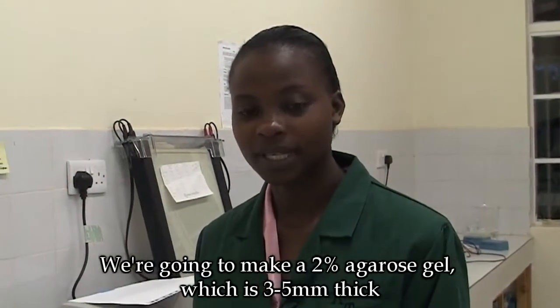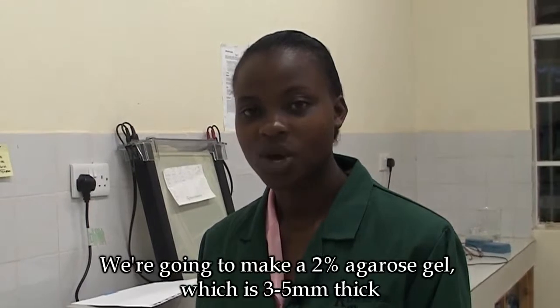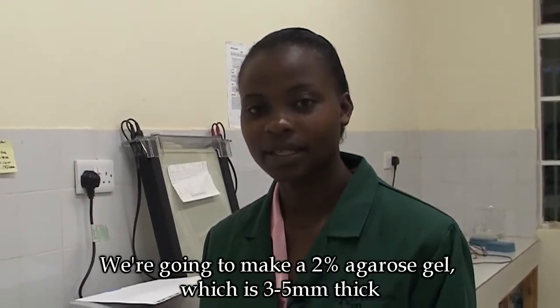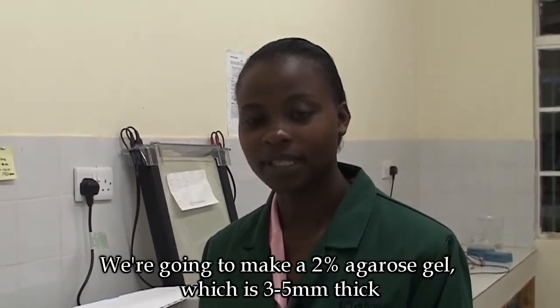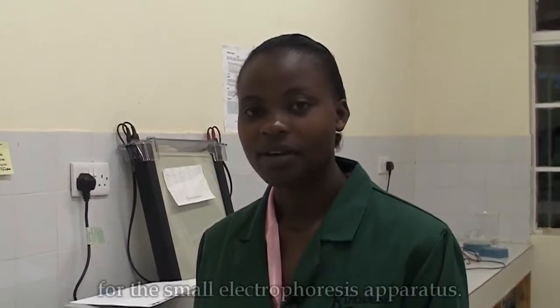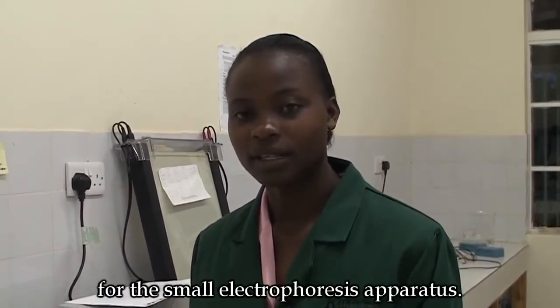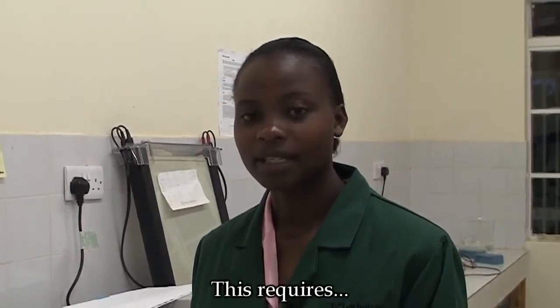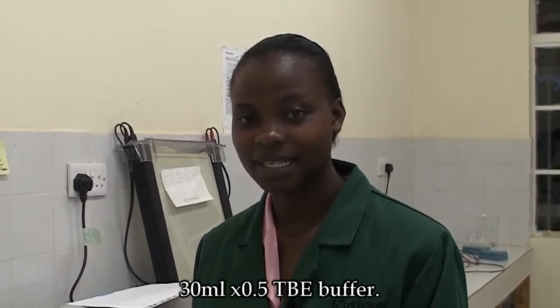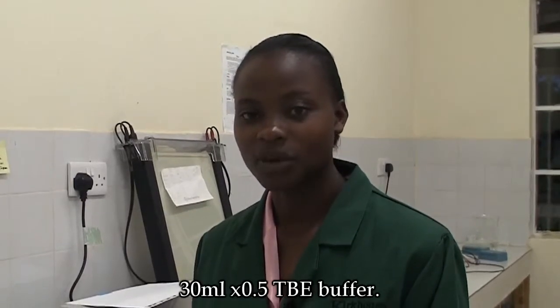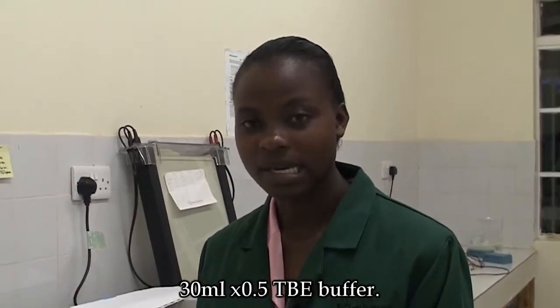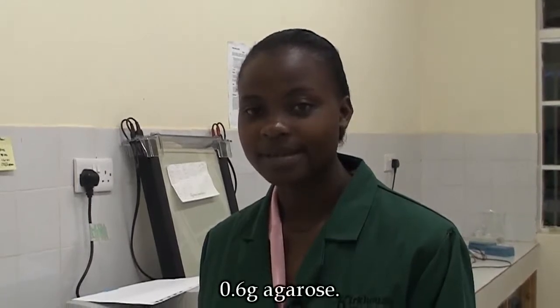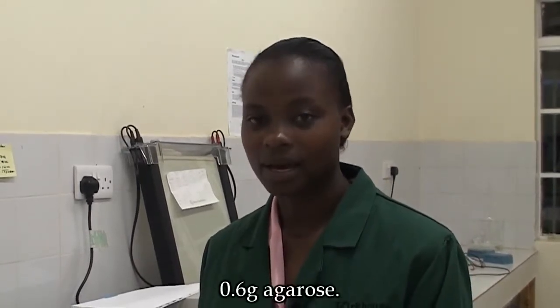We are going to make 2% agarose gel, which is 3 to 5 millimeters thick for the small electrophoresis apparatus. That requires 30 milliliters of 0.5X TBE and 0.6 grams agarose.